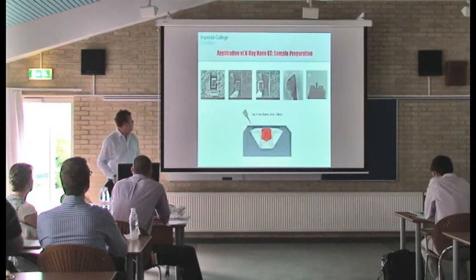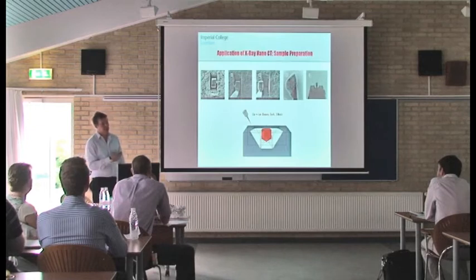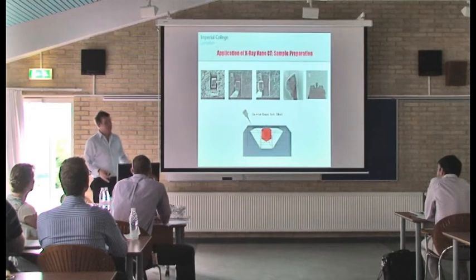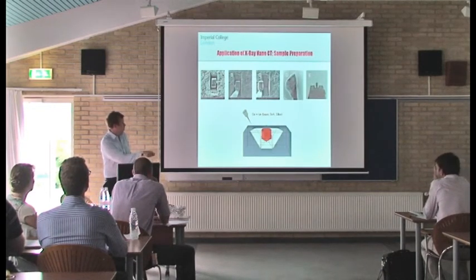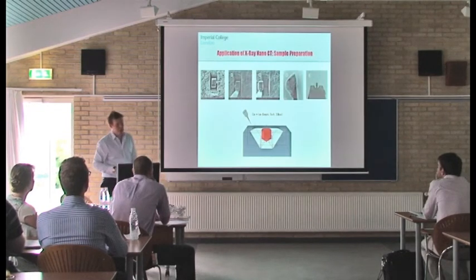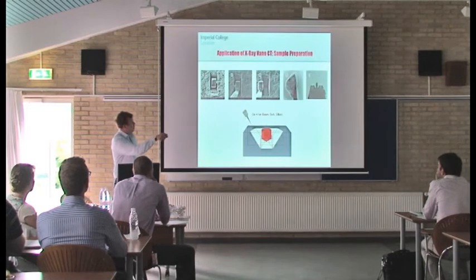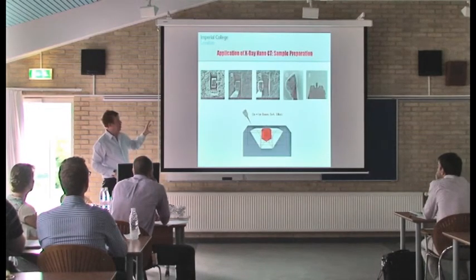it's not trivial. So we actually use a focused ion beam to prepare optimal samples for this. Basically a micro-manipulator system which we bolt onto the FIB, and then we have the gas injector system within the FIB. So we basically mill around a chunk, introduce our tungsten needle, platinum microweld, and you can see this is actually a transmission micrograph with a large field of view mode, and you can see that the whole sample is nicely fitting within that field of view.